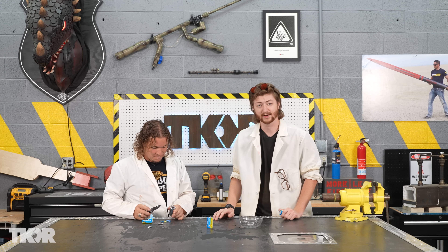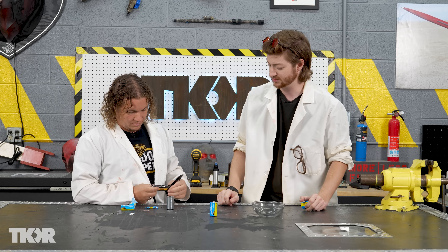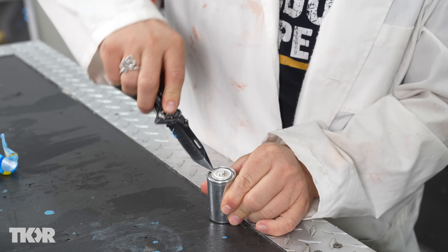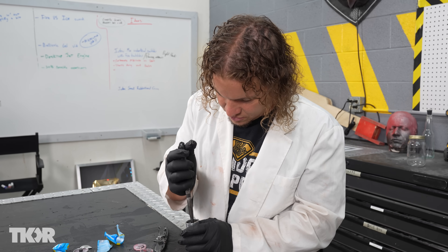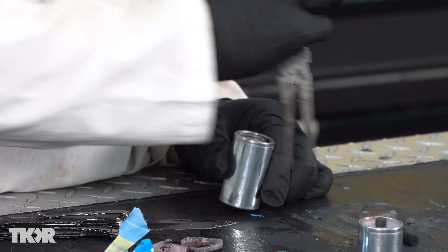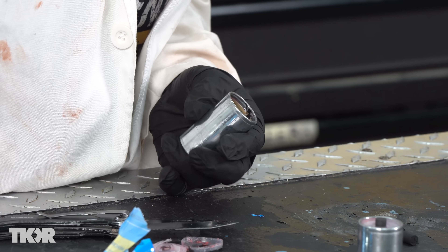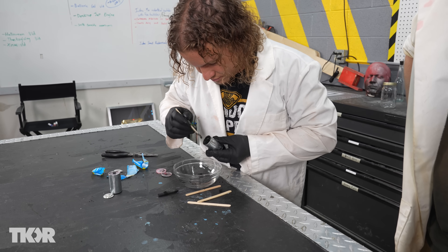He's already got one apart. There are two ways you can take these apart: one is to cut one of the ends off with a hacksaw, the other is to carefully pry up the top plate. See if we can extract our carbon rod here — just pull right out. And now we've got to scoop out our manganese dioxide. We'll just use a popsicle stick to carefully scoop it out.